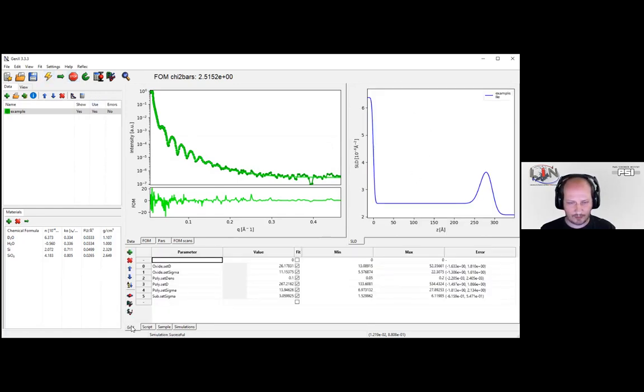And now in this interface, we have first the parameter grid. That's the normal way to define what is fitted. Any parameter that is a floating point value can be fitted of the model. And the value here is shown with some bar about the position in its range. Here the ranges are set automatically from the simple reflectivity model, but you can modify them. Let's say we want the thickness of the oxide to not be below 10 and not above, let's say 40. Then you see that the gray bar has changed a little bit.